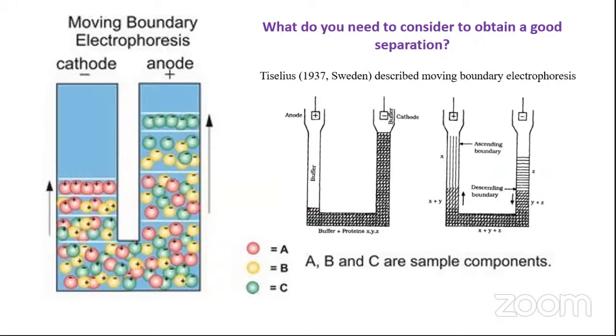It's quite easy here because the solution, that is the mix of proteins, is going to be denser compared to the buffer, right? And that's our purpose of detection as well. When we detect refractive index, that's what you are actually going to see, correct?